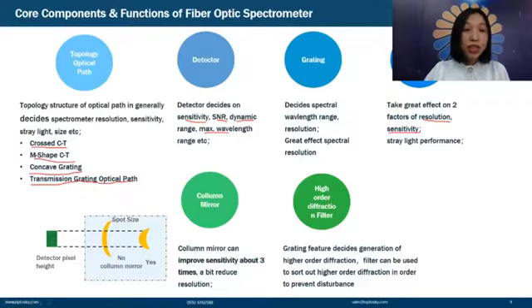And if the spot beam is generated like a crescent moon, thin and long, you can see most energies cannot be absorbed by the detector. So if we add the cylindrical mirror, we can compress this crescent moon to be fatter and shorter. In this one, we can absorb most, 80 to 90%, of the light energy into the detector. So it can improve the sensitivity about 3 times.